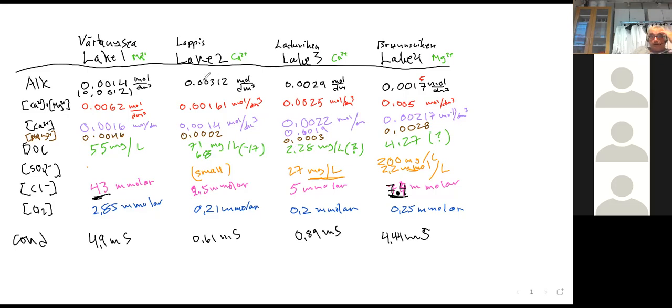Or this DOC could also be this permanganate number. Then you multiply by the potassium permanganate, which is 150, slightly more. Then it's weird, because then me and Chris have gotten different values, I think. But we did the same experiment. I don't know. We'll talk about it.